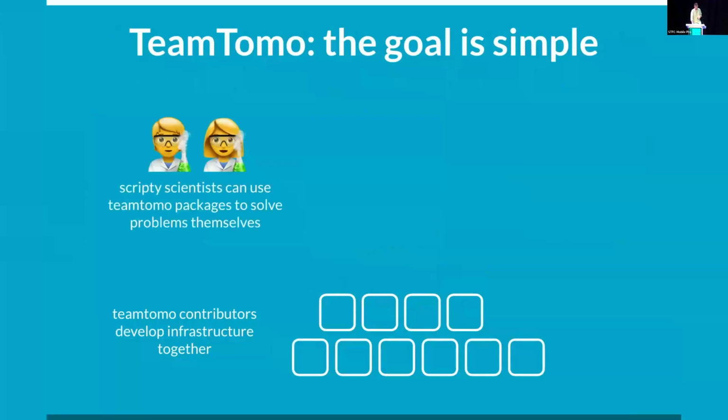And then if you've got scientists who are willing to do a little bit of scripting, more and more people come in with a little bit of Python experience, or it's getting taught at university. Ewan, you're a great example of this. I saw you smiling. They can then solve their own problems. You're going to have problems. We're not going to have solved them all in the software packages. We should make it as easy as possible for you to go and solve them yourself.